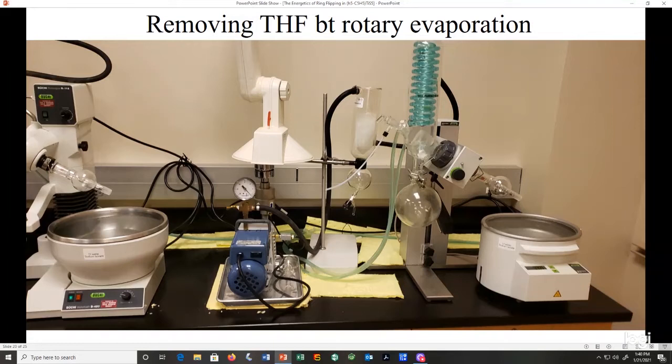Rotary evaporation uses a combination of temperature and reduced pressure to quickly evaporate and remove solvents from a system based on their boiling points. So let's go over the individual components of this rotovap. First, we have a water bath, and we can control the temperature of our solvent in this water bath. And then we have an armature that spins here, and by spinning, it creates more surface area inside that round bottom flask, which increases the rate of evaporation.